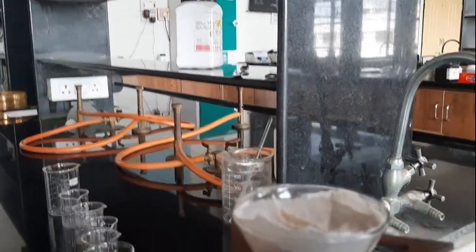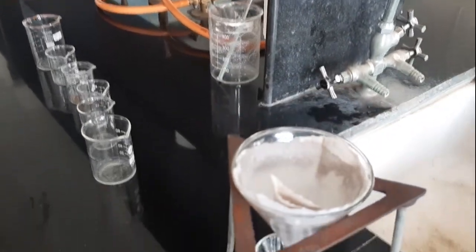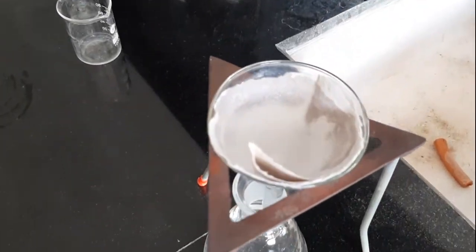Once we obtain the filtrate, we will divide it into 6 parts.